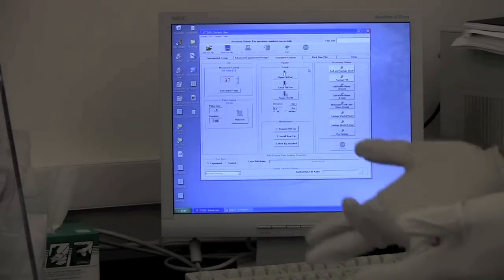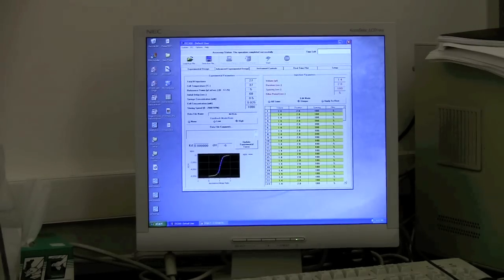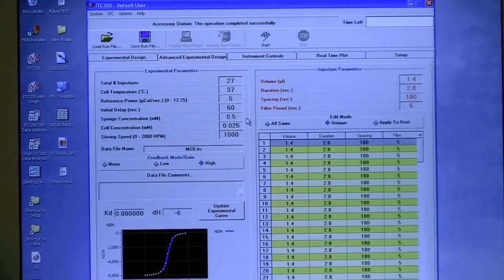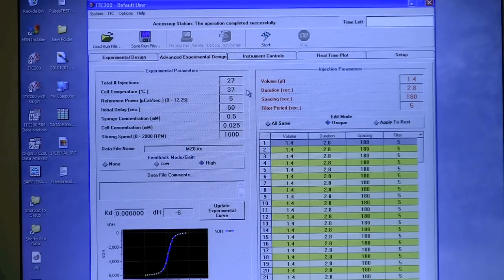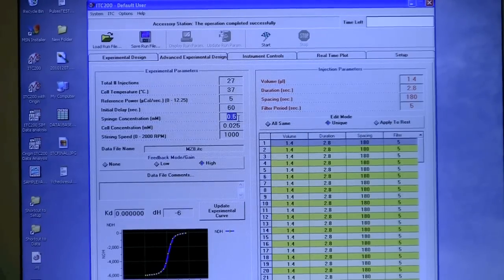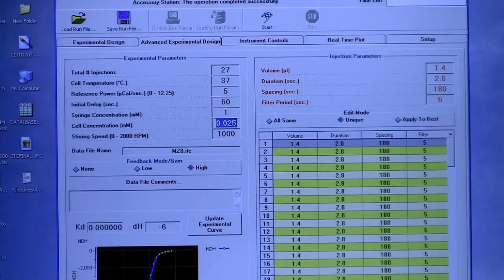The next step is to set up the experiment. Switch from Instrument Controls to the Advanced Experimental Design tab. You will see different settings. For total injections, generally keep it between 25 to 35, depending on your need or published literature. Set the cell temperature as needed. You can fill in the syringe concentration value — for example, 1 millimolar — and the cell concentration, for example 25 micromolar (0.025).